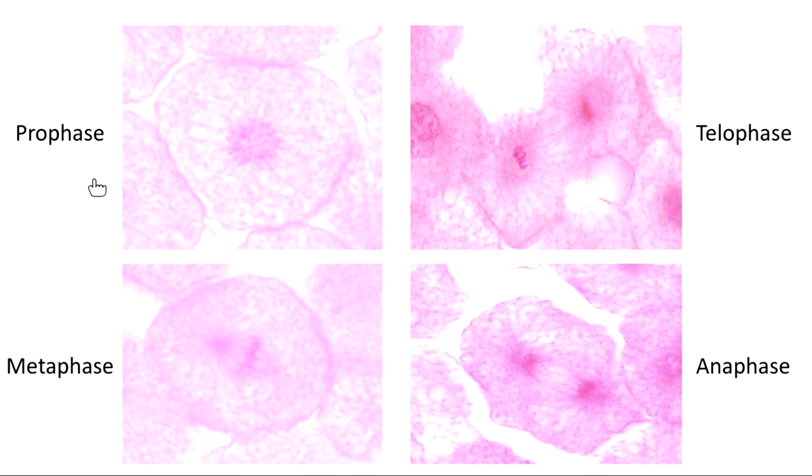So remember, in the process of prophase, some of the things that happen is the nucleus dissolves. We also see the chromosomes start to form. This particular cell is a cell in prophase because see all of these little dark spots I see inside here? Notice, like I mentioned, our cells aren't beautifully colored like those pictures I showed you. So here's my outer membrane, the plasma membrane of this cell. Inside the cell, we've got a lot of proteins, a lot of other stuff. My genetic information is the darker colored stuff in here.